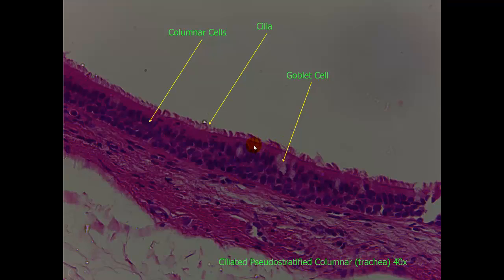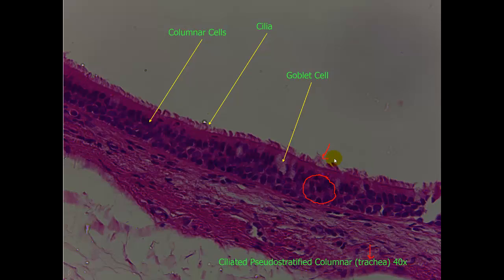Here is ciliated pseudostratified columnar. This is in the trachea at a 40x magnification. On the last slide you could see that nice delineation between the two layers of cells, and the nuclei were spread apart. Here, notice that all these nuclei seem to be jammed together within these columnar cells — that's going to help identify it as pseudostratified. It's not the only indication, but it does help. On the apical side, we can see the cilia, those tiny hair-like projections used to produce movement. We can also see the goblet cells, which appear as spaces.